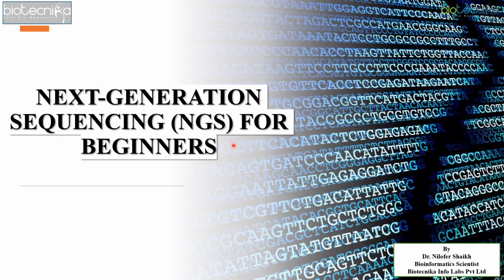Before moving ahead, we have to understand the need to explore next generation sequencing. As we all know, with high throughput techniques and tools we are able to identify novel variants and mutations, such as SNP kind of mutations, using the technique called next generation sequencing. Because it is considered one of the high throughput techniques, it gives very precise findings and even the identification of novel mutations using certain techniques. And that can even be done using the reference genome sequence of your interest.